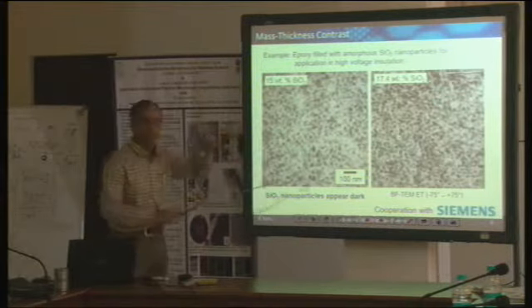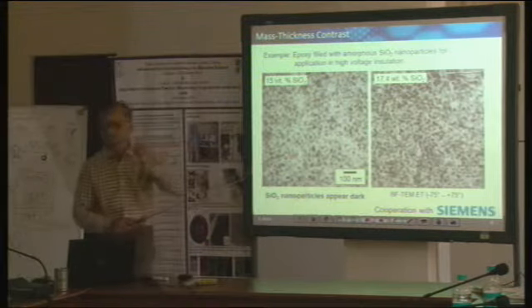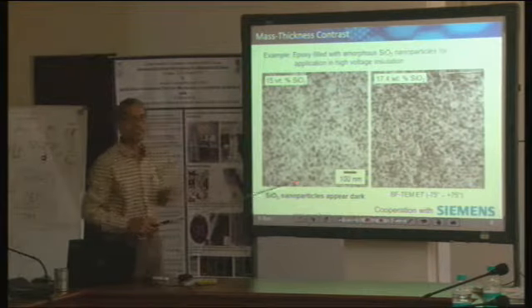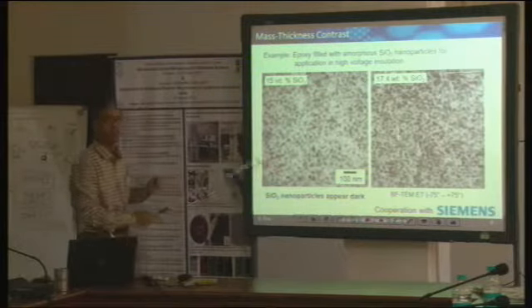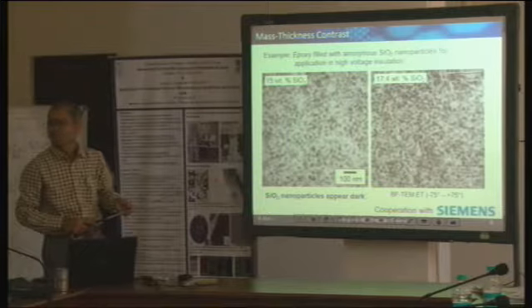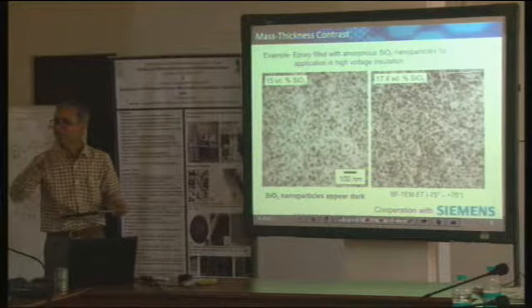Even if the matrix was amorphous, if, let's theoretically or just make an imagination, these silicon dioxide nanoparticles were not amorphous but were crystalline, how would the situation have been in this image? It would have been the same? Huh? It would have been the same?